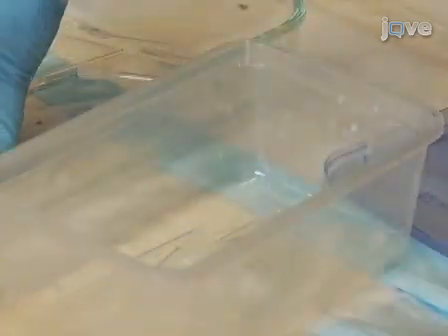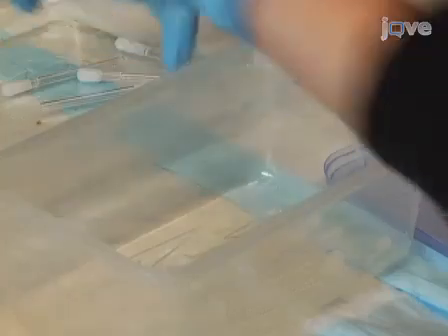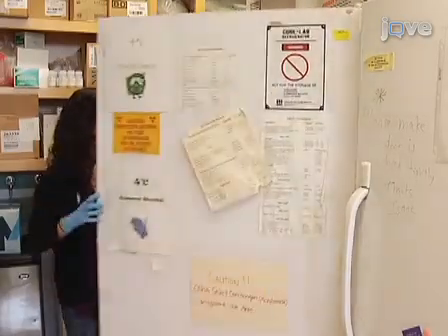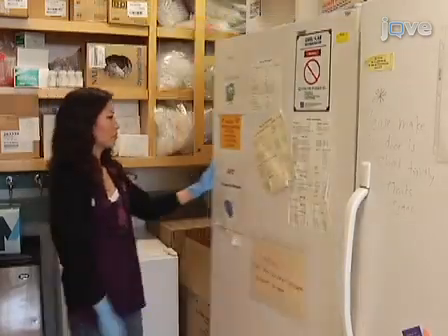The tubes can be used right away or stored in an airtight container at 4 degrees Celsius for use within a week. Prolonged storage will lead to excessive drying of the food. If the tubes are stored at 4 degrees Celsius, warm them up to ambient temperature by leaving them on the bench top prior to use.